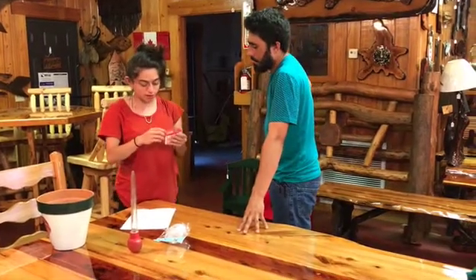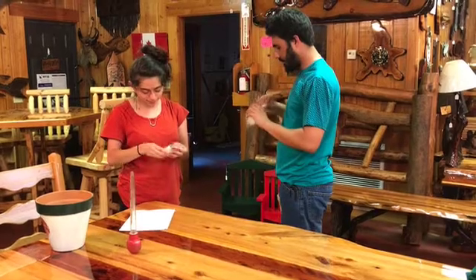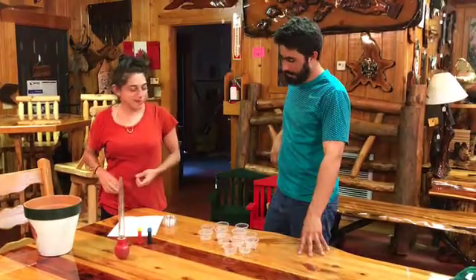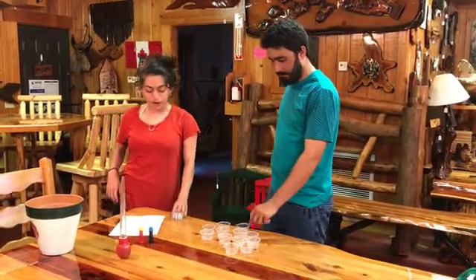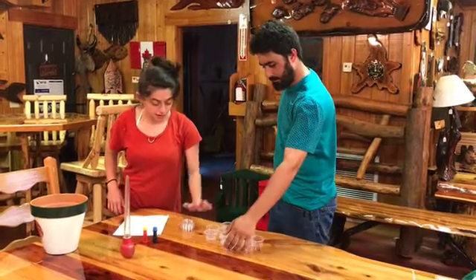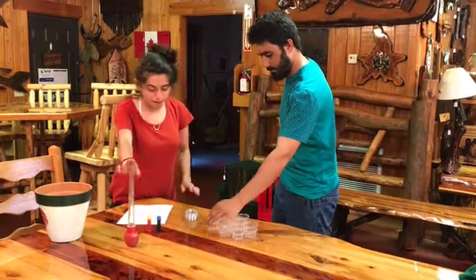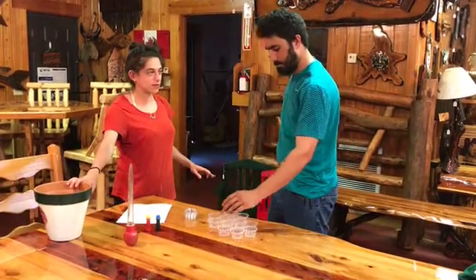And so I'm going to go ahead and prepare the materials. If you could open up the cuvettes, please. So like I said before, our materials include the parafilm, the cuvettes, Bradford reagent, pipette, and spectrophotometer.